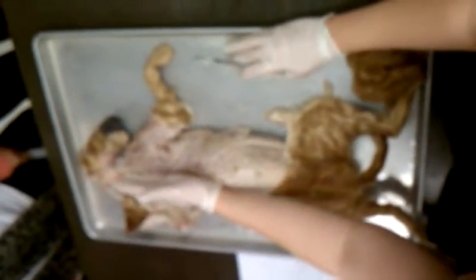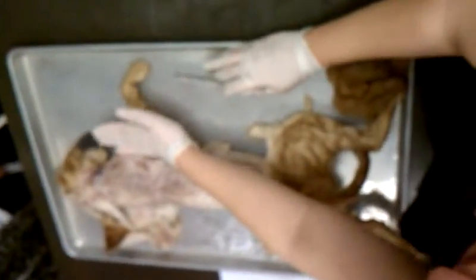The ones that are more medial have trapezius as the suffix. The ones that are more lateral have deltoid as the suffix, okay? So on the top of his shoulder here, kind of coming from his neck, you have this muscle right here. If you look at the top of his shoulder, it may be hard to show some people, but there's a little line right here, and that's where it ends. So it goes from here to here. This guy right here is the clavotrapezius.